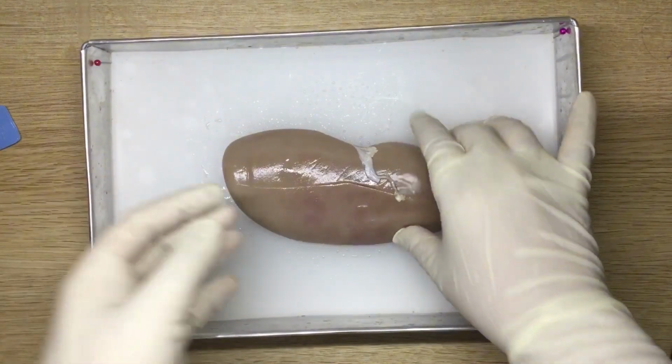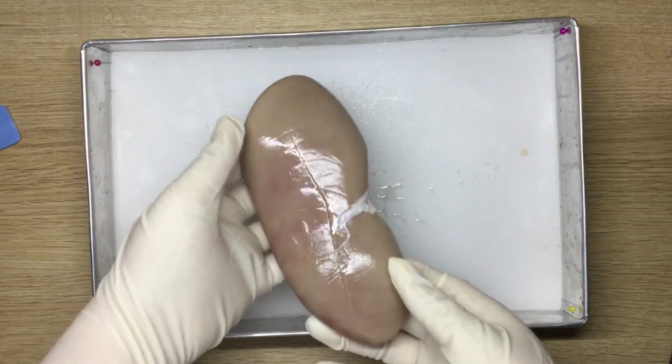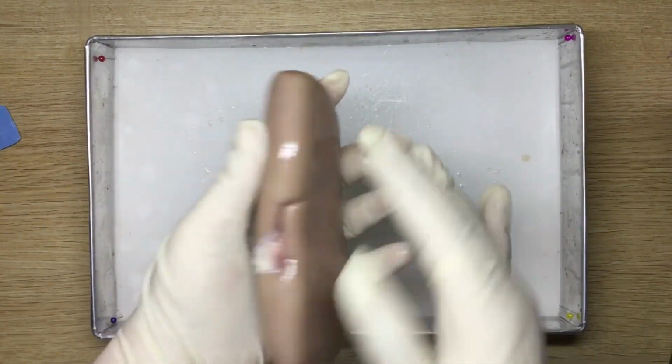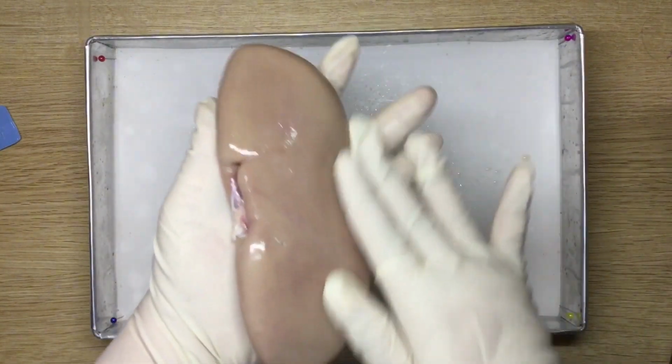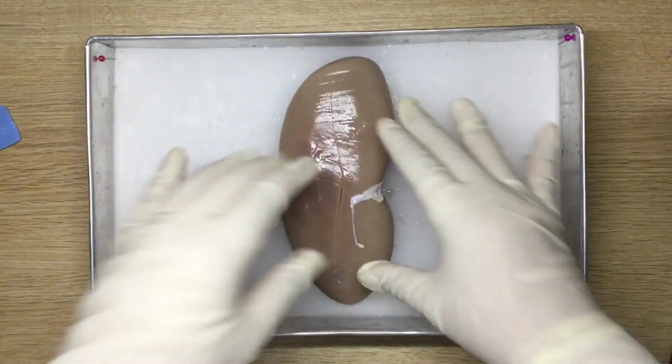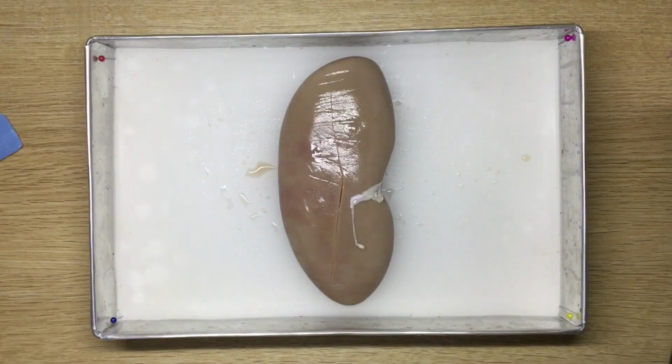this exciting activity. We will examine the outside of the kidney and then cut it open to identify the structures inside the kidney. In this dissecting activity, we will be using the scalpel or a scissor to cut it open.